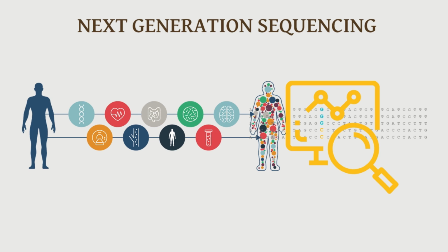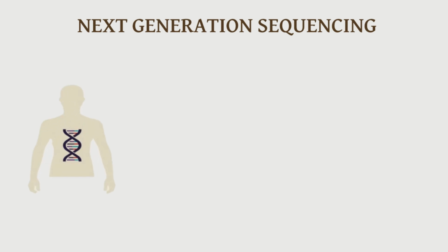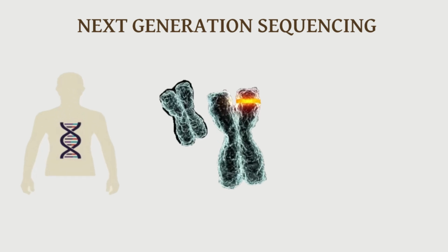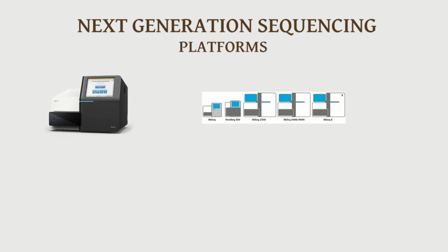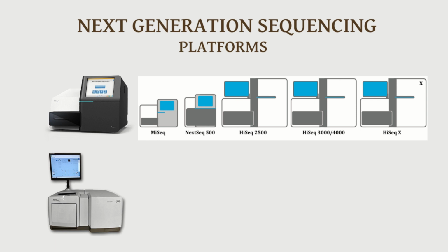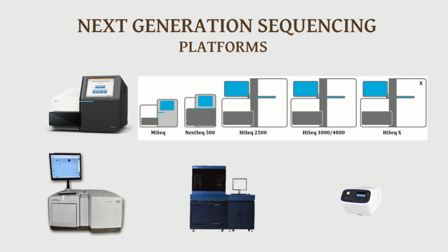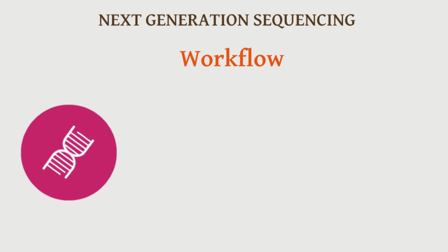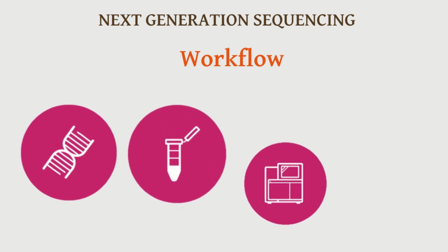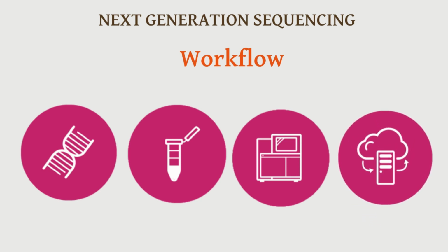Next generation sequencing is also known as massively parallel sequencing. It is a powerful technique that has enabled advances in personalized medicine, genetic disease research, and clinical diagnosis. Examples of next-generation sequencing platforms include the MiSeq, the HiSeq, 454, SOLiD, and Ion Proton. Although many NGS technologies have been developed over the years, they all share the same common features, and these include nucleic acid extraction, sample preparation, sequencing, and data analysis.